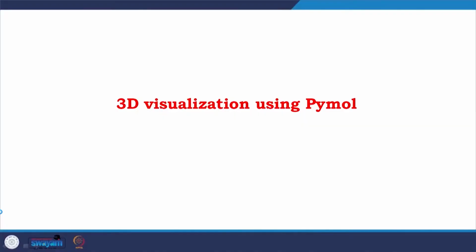Today we would be starting with the softwares which are majorly focused onto the visualization. Coot is also a visualization software, but people do more functional work like modification and all. So, let us come to 3D visualization with the visualization platforms, and I would majorly focus on a software platform which is called PyMOL.